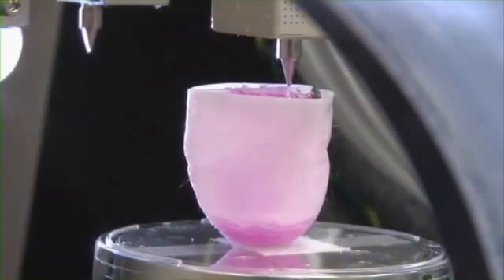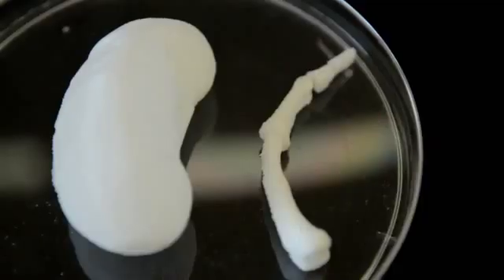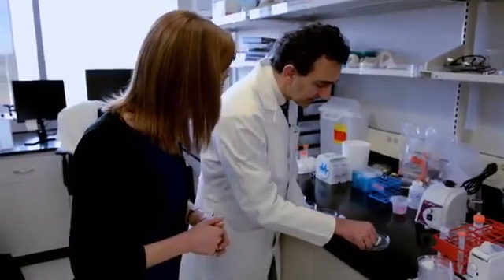Well, up until just recently, the way that we made these tissues was to actually create them by hand, one by one. When you start thinking about getting these technologies to many patients and creating thousands of these organs at the same time, you need to automate the process, and that's where bioprinting comes in. Meaning you can make thousands of kidneys. You could make thousands of organs. You know, you just pick the organ you want to make, then you allow the printer to do them over and over again. And is this a finger? This is actually a finger.